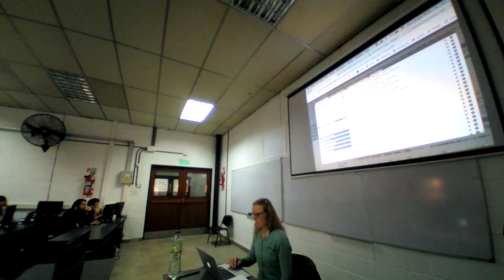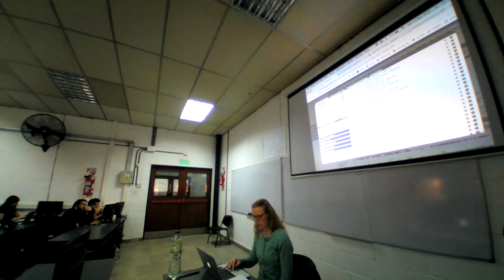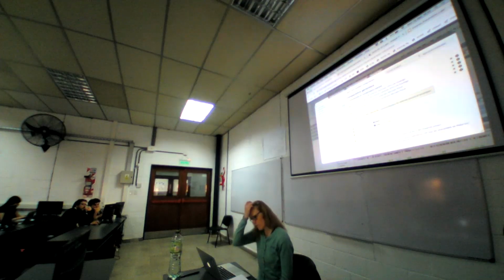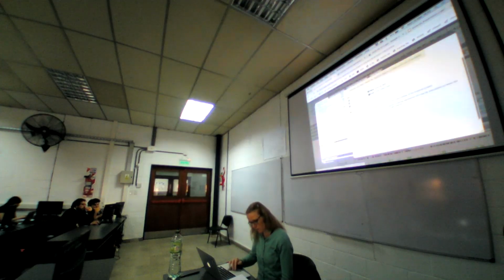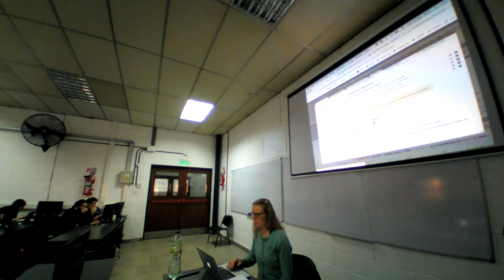And now I will add some tracks for conserved regions as well, under conservation regions. There's one which is already pre-selected here for constrained elements, and I will add the one for the conservation scores just above that too. And then I will close this menu.